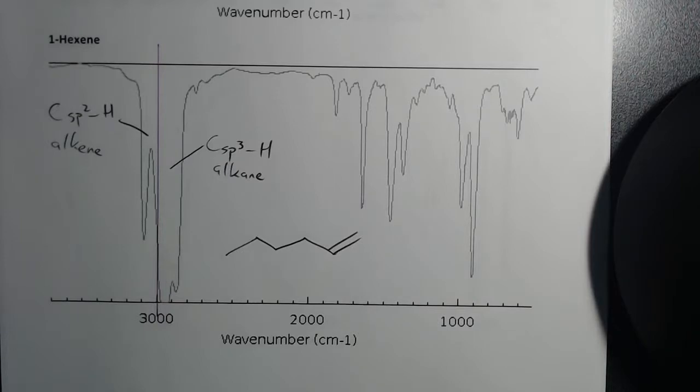And then there is one other peak of significance that we can probably pick out, and it is the double bonds. Double bonds are useful information in IR. They're typically pretty easy to pick out. You guys remember what shows up at about 1700? I think it was on the quiz for pre-lab, right? What is 1700? That's your carbonyl stretch.